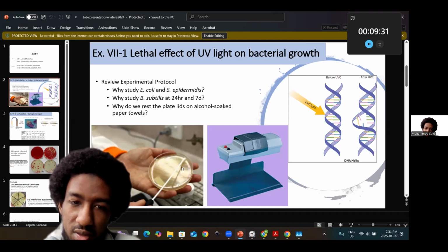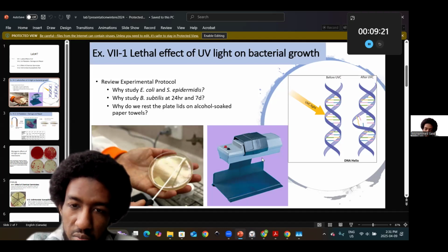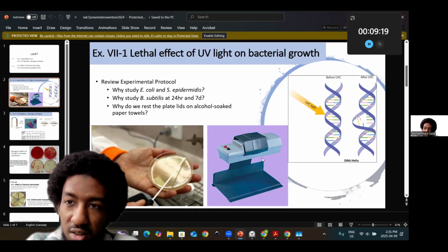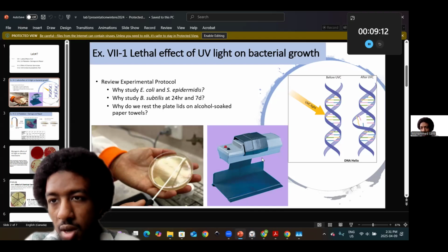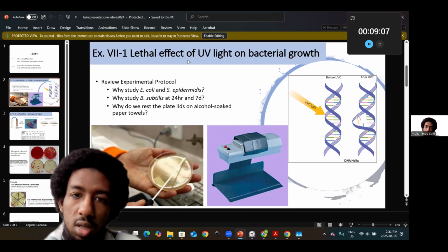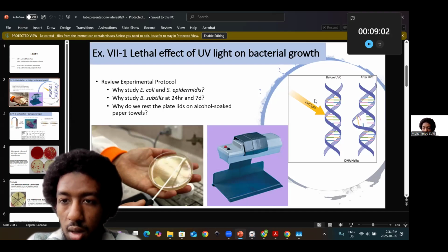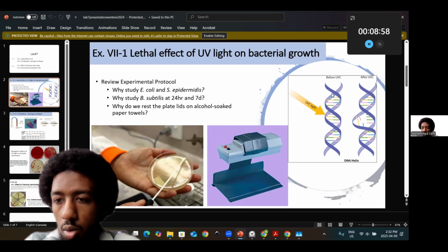And with that, you would have essentially spread your bacteria with 1/3 turns, inoculations, right? And then you would have placed them under UV, right? I know there were a lot of sets of plates that we were dealing with, but hopefully, even just for this exercise, you would be able to understand the limitations, the conditions, and the different expectations that you would have had across the different bacteria based on the traits that we've described, right? And the features that they have potentially against UV exposure.